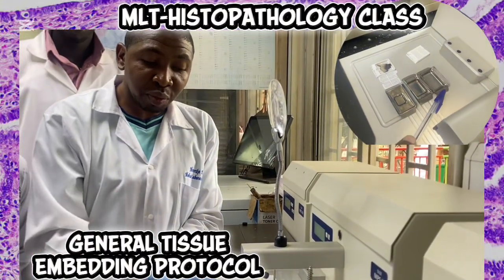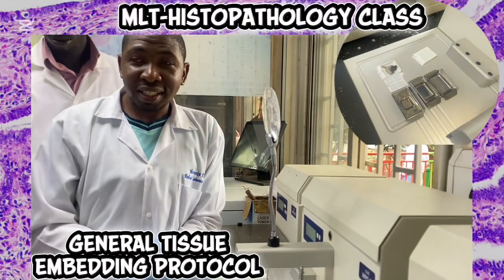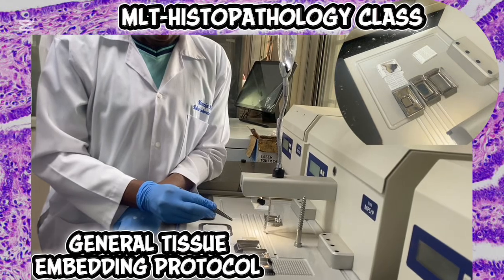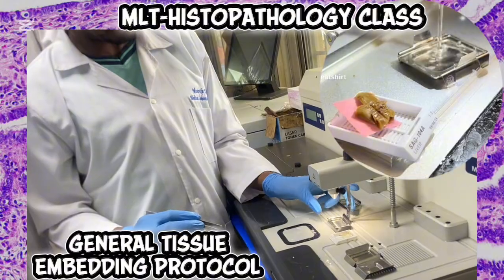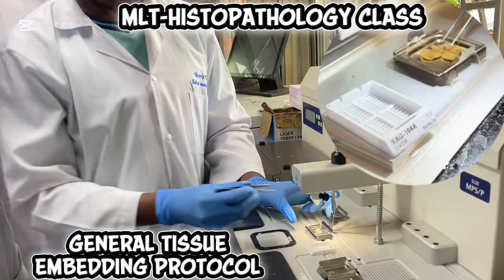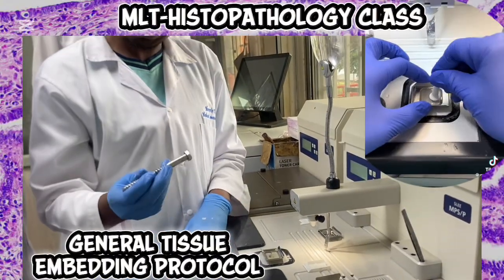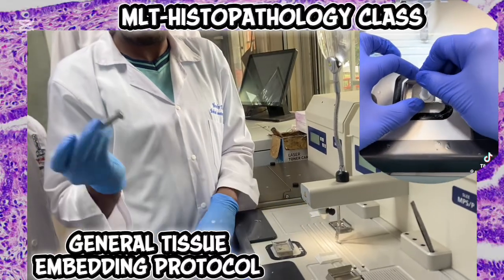What would be the appropriate mold basing on the size of this tissue? The middle one, not this one. Why don't we use this one? This one is large. Okay, we're going to try. We're going to supply the mold with paraffin wax. So carry our tissue into the mold. Transfer onto the cold plate and orient, put it properly in the mold. We tap to ensure that the tissue is on the surface of the mold.